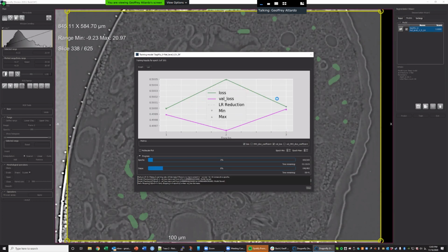Yeah, the previous model that I ran, that worked well with the training data, didn't start to actually shift until about 100 epochs in, and then I started to see improvement. I don't know if that's unusual or normal.